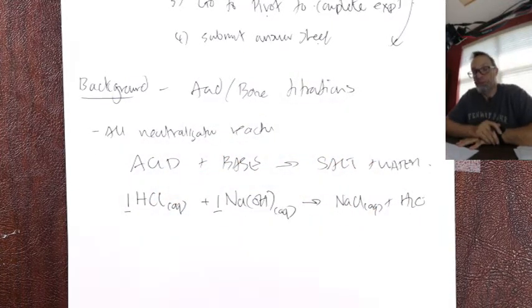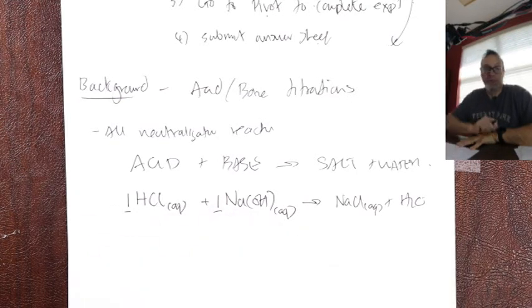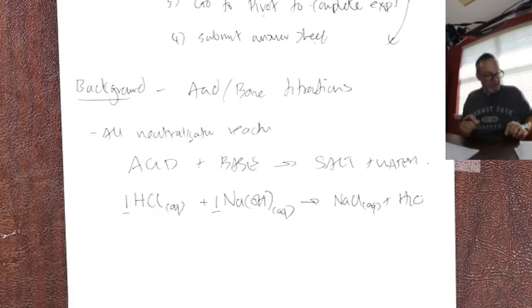Now, we haven't talked about concentrations yet. I'll talk about it a little bit here, and it'll set you up nicely for the next packet. But simply, you can work out the moles, because 1 mole balances 1 mole. You can work out the moles in a solution by its strength times its volume, which is actually pretty straightforward. We'll get to it formally in class, but we'll see it when we get there.